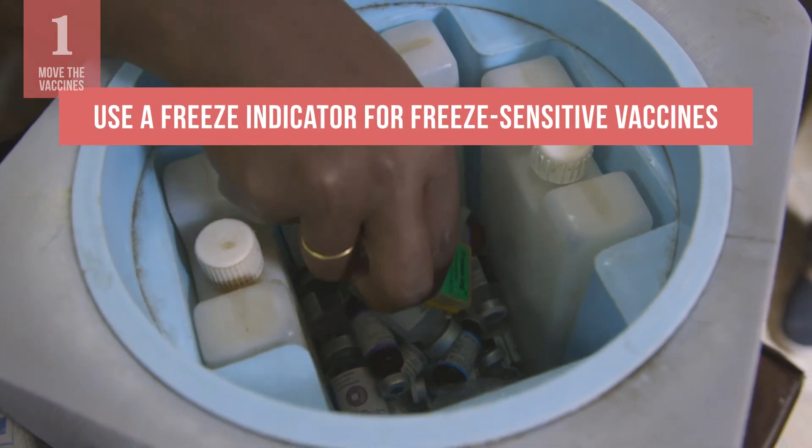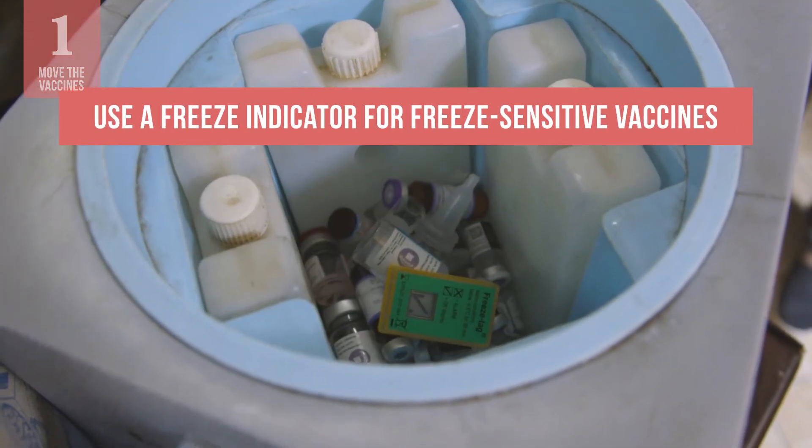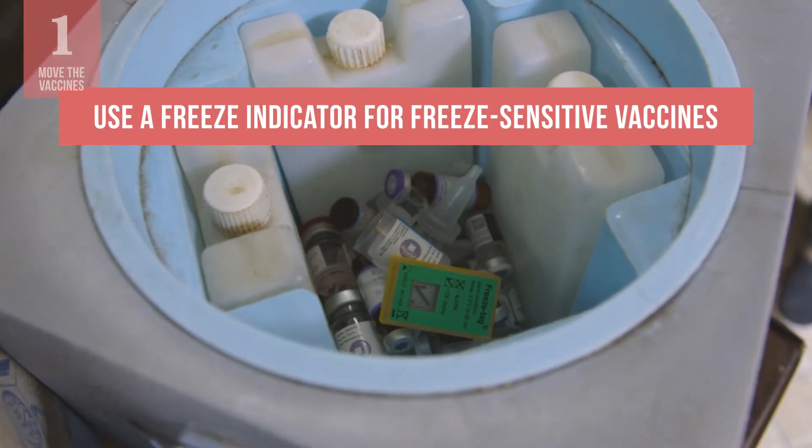No matter where you move the vaccines, always keep a freeze indicator with the freeze-sensitive vaccines.